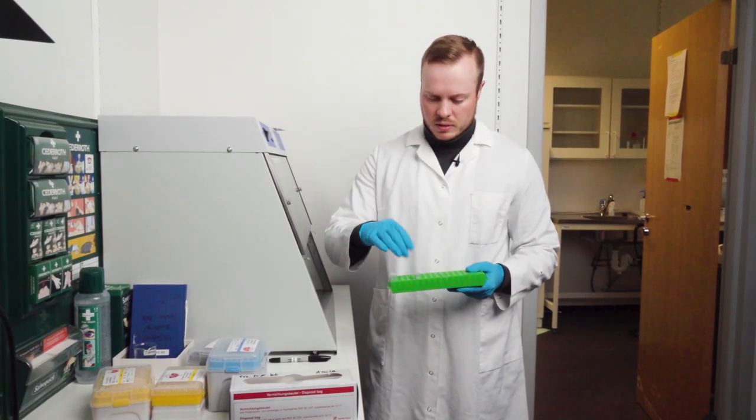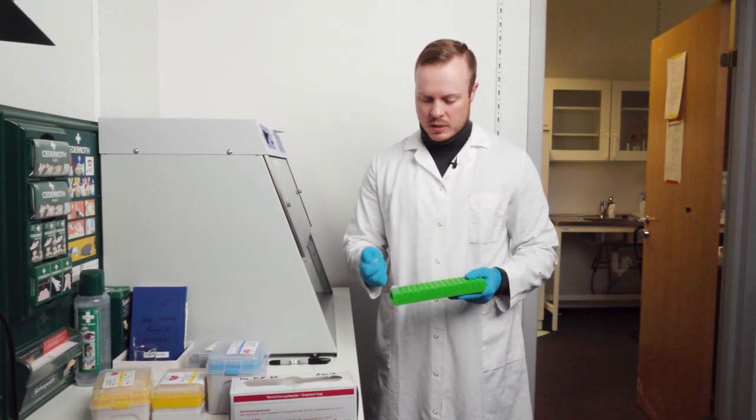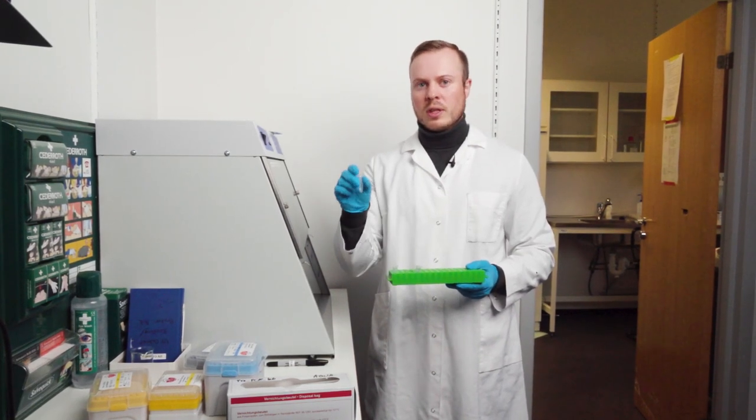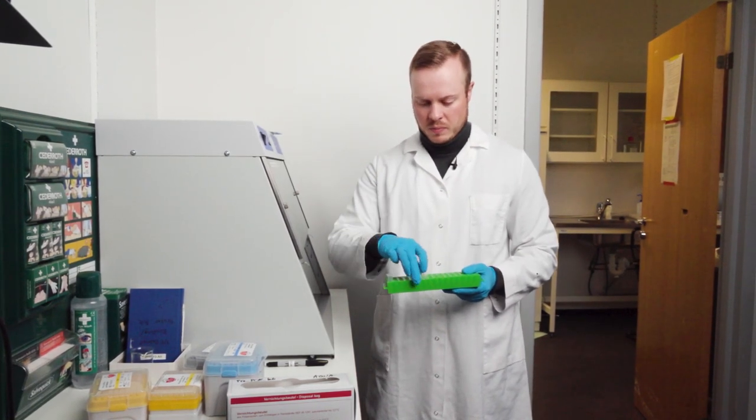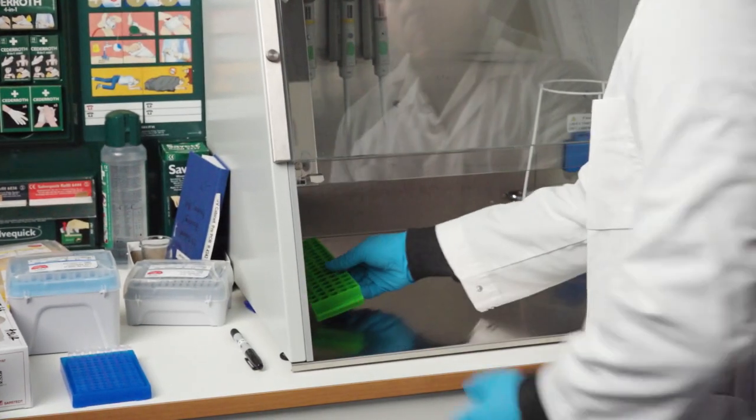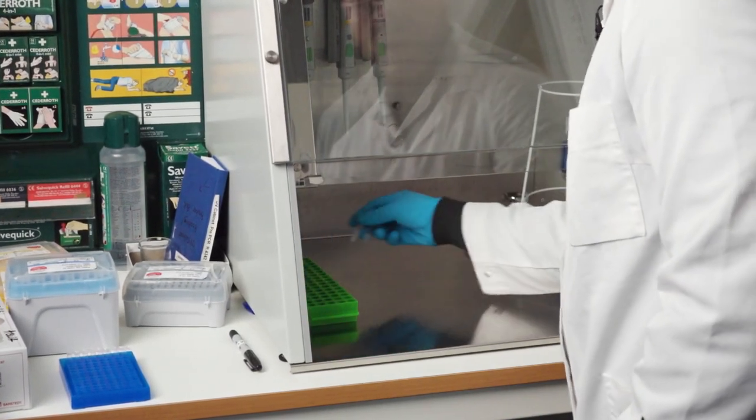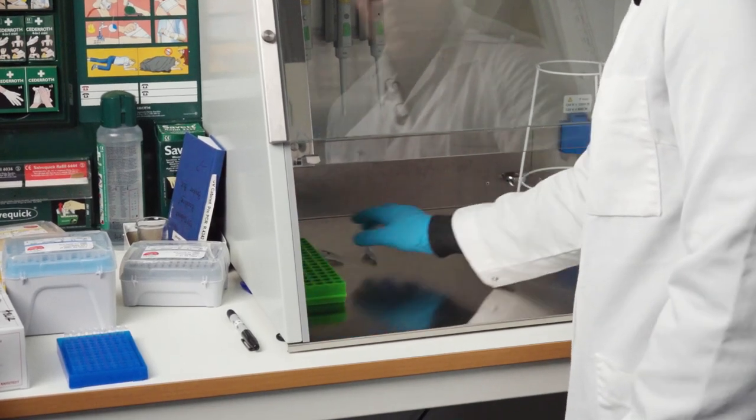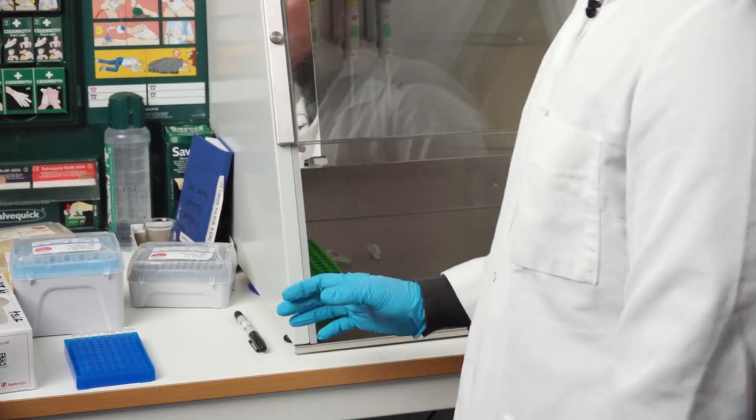So the first thing that is very important to sterilize is the vials with PCR water because PCR water is the main contaminant in PCRs. So I move them into the cabinet and actually take the vials out of the rack so it gets maximum exposure to UV light.